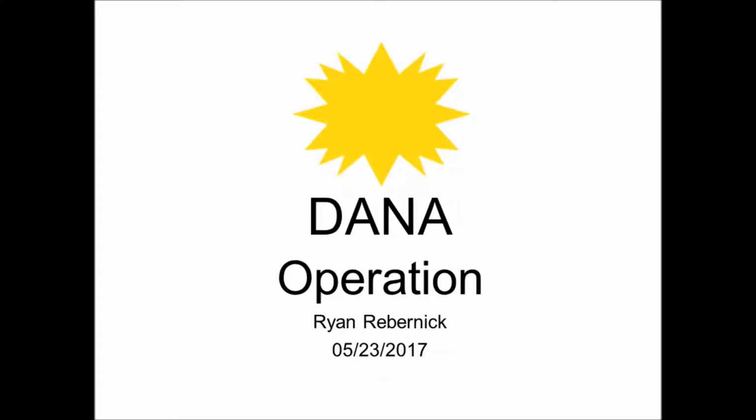In this next tutorial, we're going to focus on how to operate Dana, specifically how to use the batch processing functions, the single image functions, and we're also going to look at the kind of output that Dana gives you.